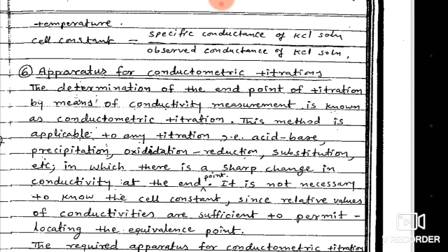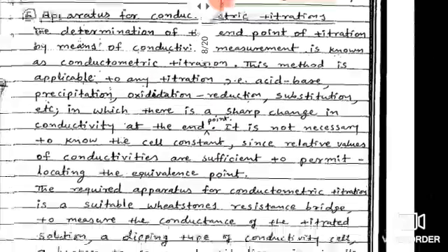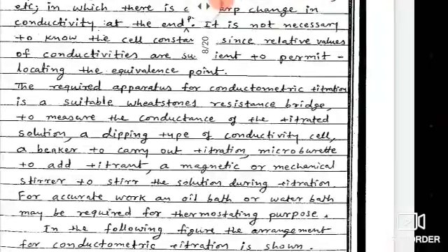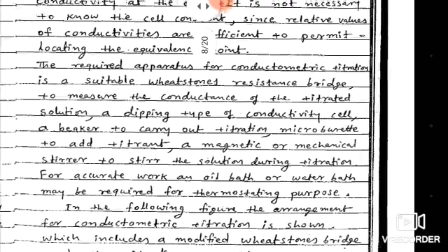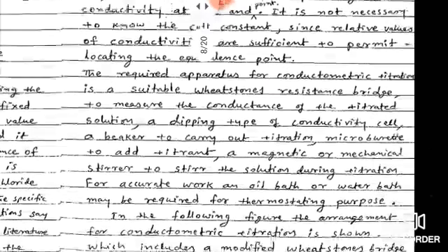So at the equivalence point there is a sharp change in the conductance reading in the experiment, and with the help of this we can determine the end point.